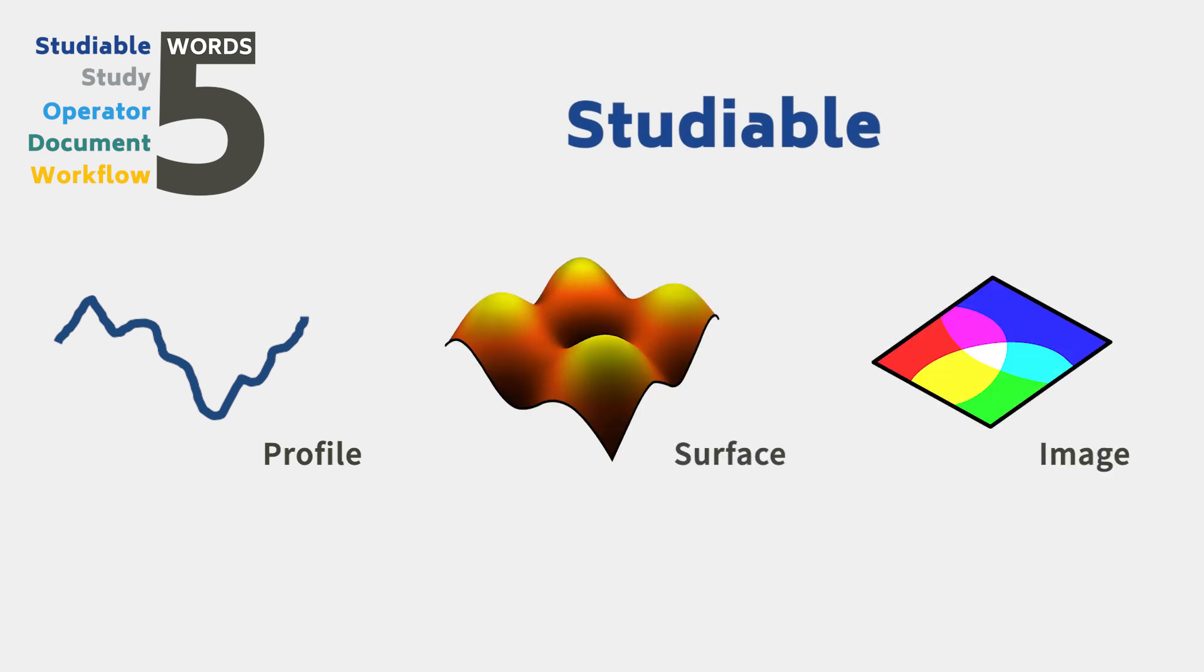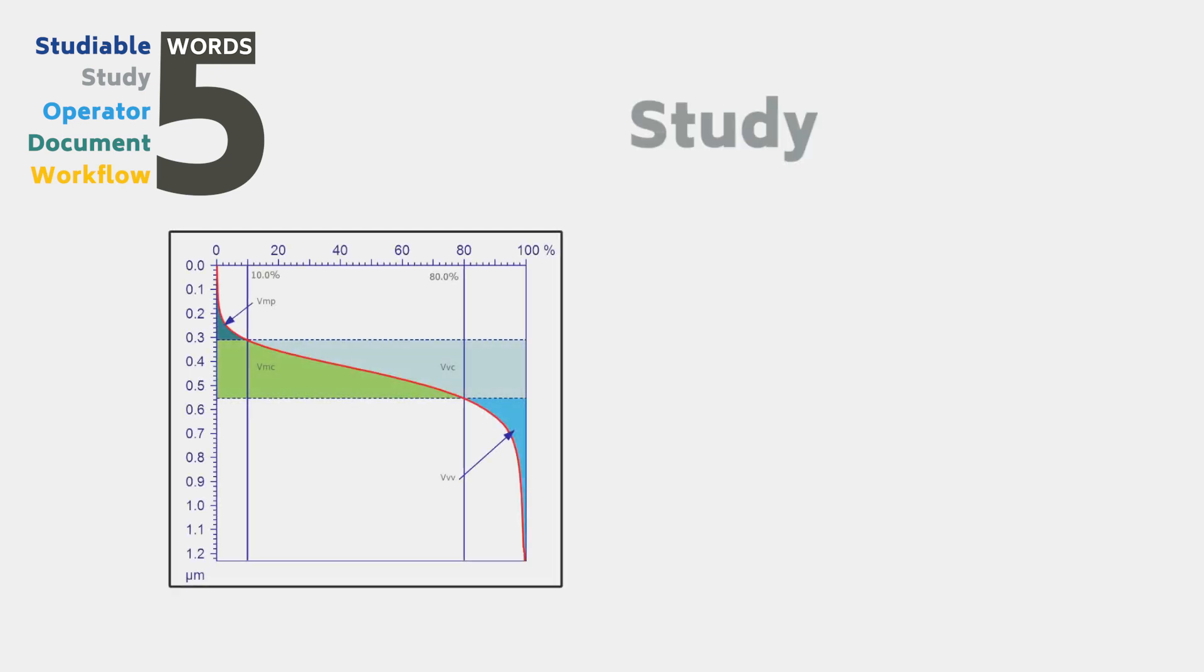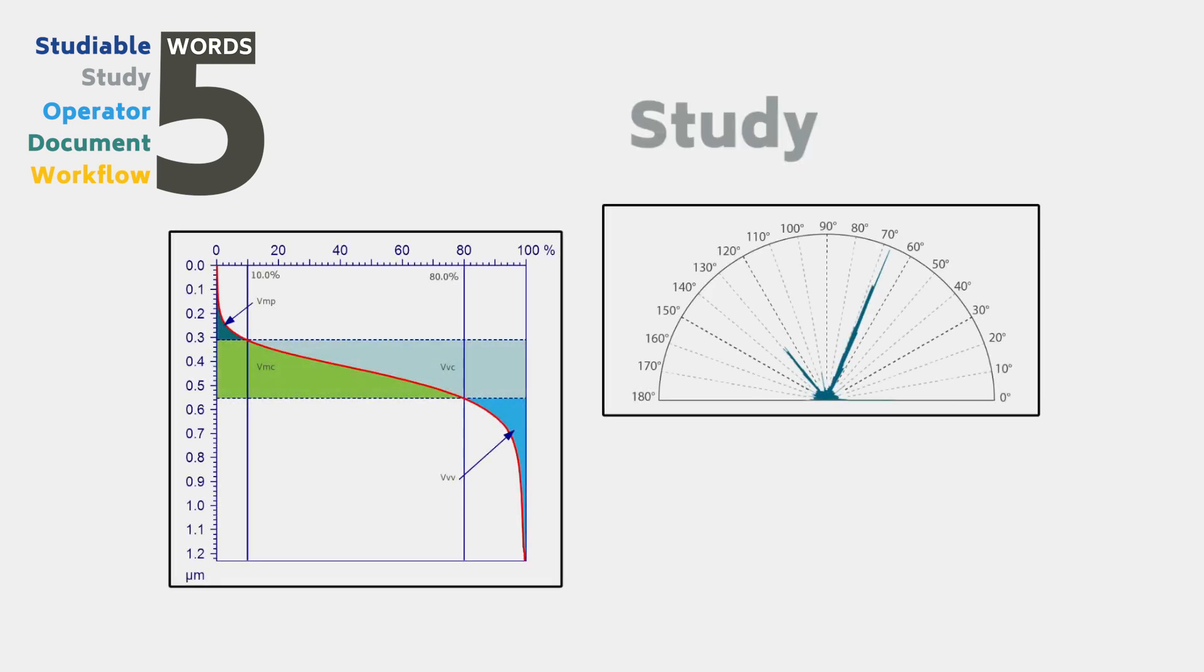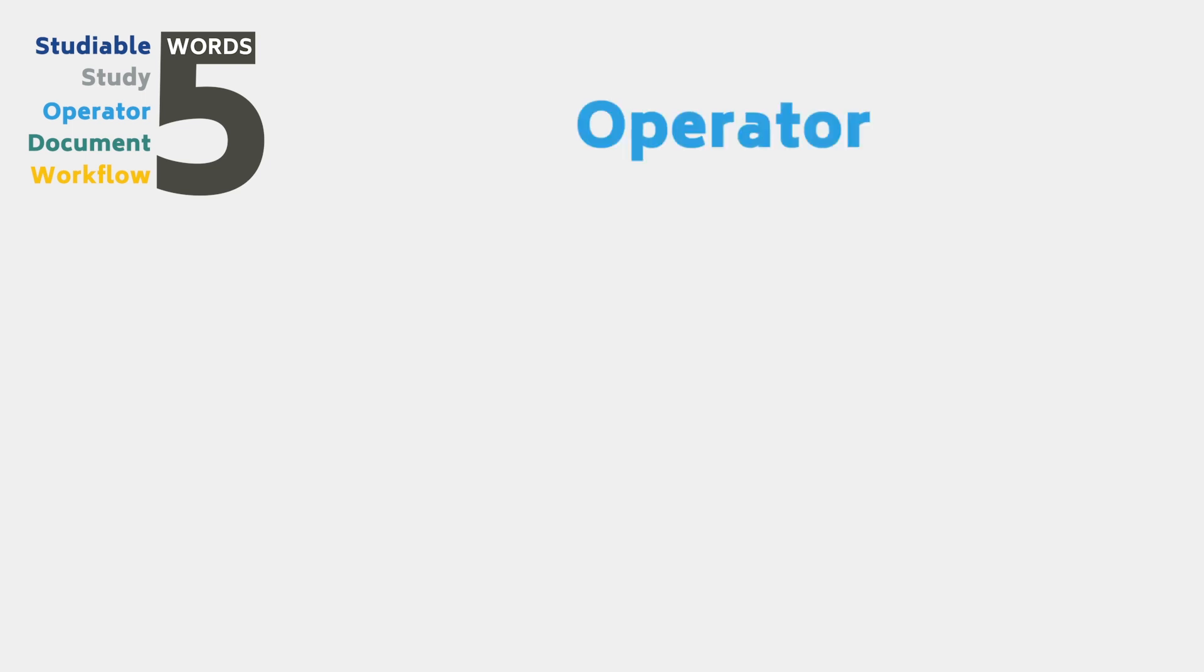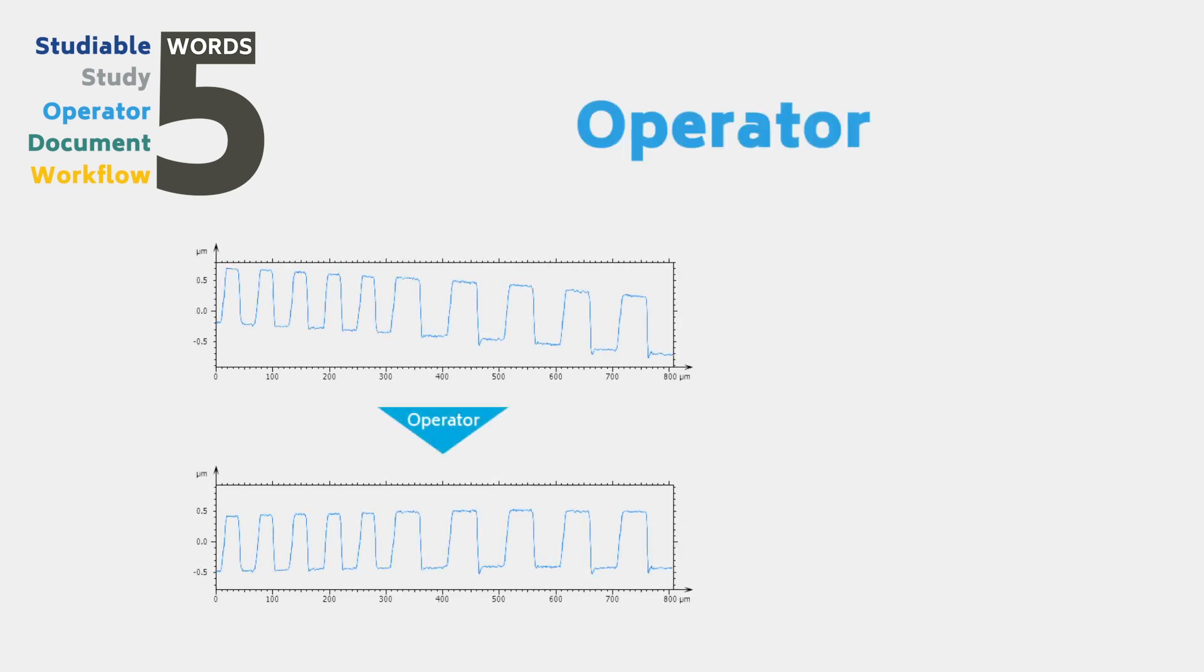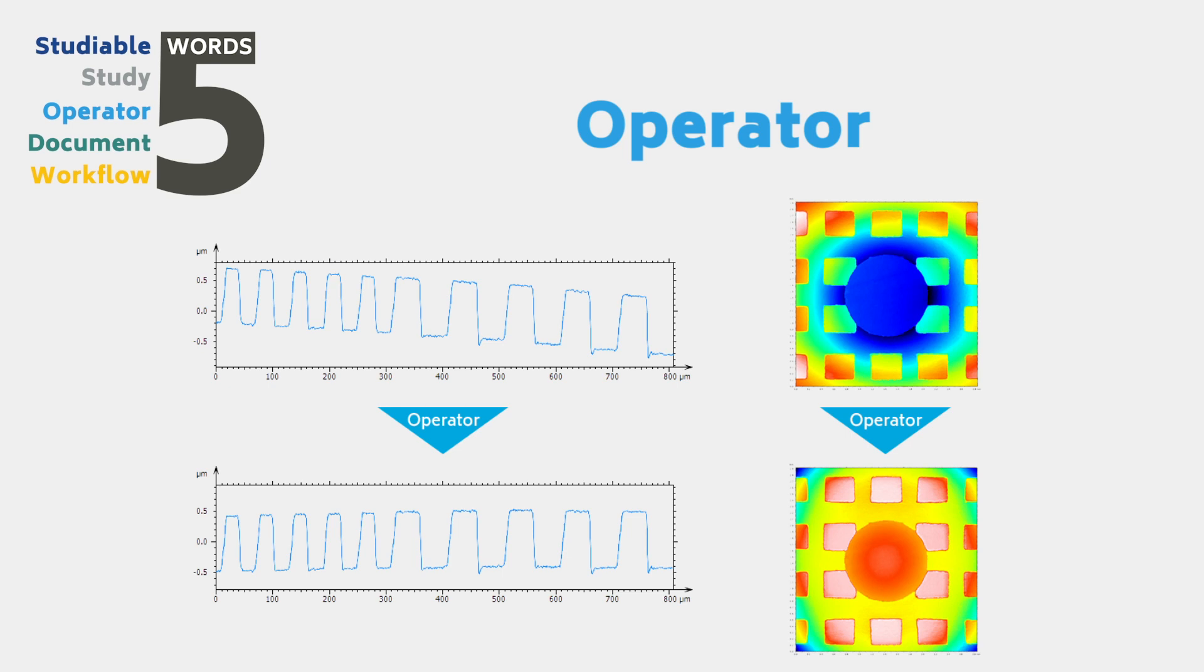Profile and surface data obtained from profilometers or images obtained from microscopes, to give just a few examples. A study is a frame in the document which displays data or analysis routines applied to data. An operator is a tool used to modify a studyable.